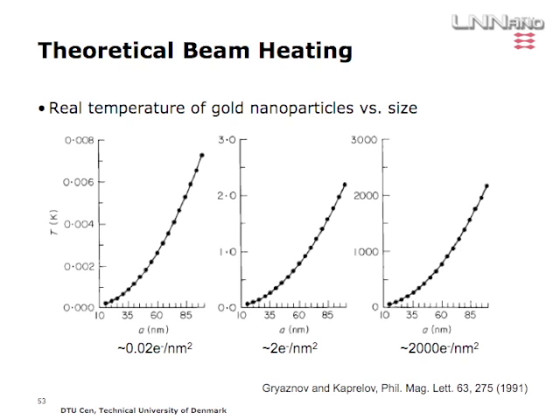And there's this very nice theoretical treatment by a couple of Russian guys, about 20 years old now, where they have calculated the local temperature increase as a function of current density on the sample. And this actually is the particle size, because there are so many parameters that influence the local temperature. And in the region we are, I think, the middle one, you see there's basically no increase in temperature. We are at least below 10 nanometer particles down here. So they don't see any, if this is true or not.